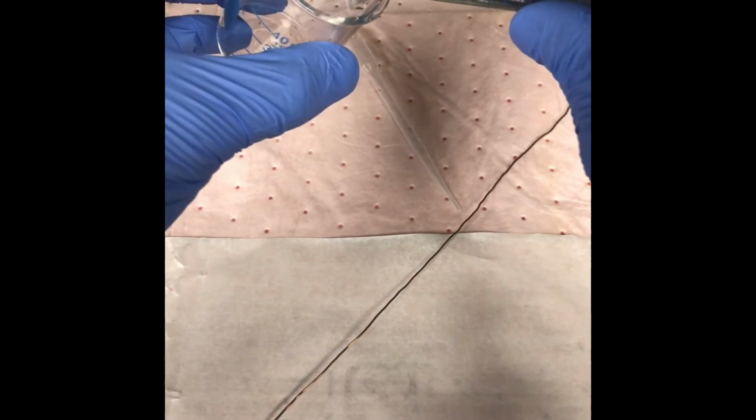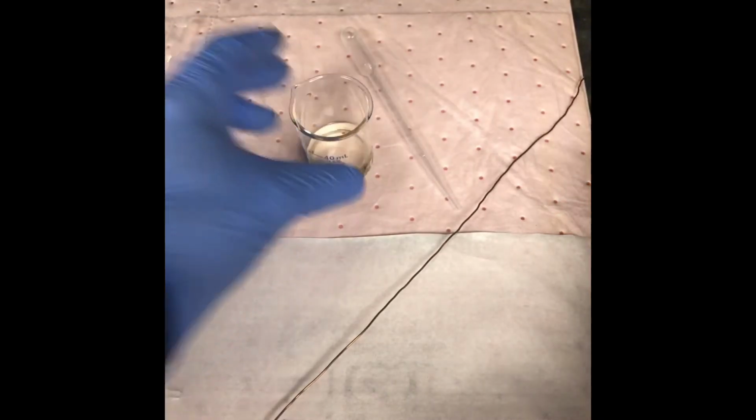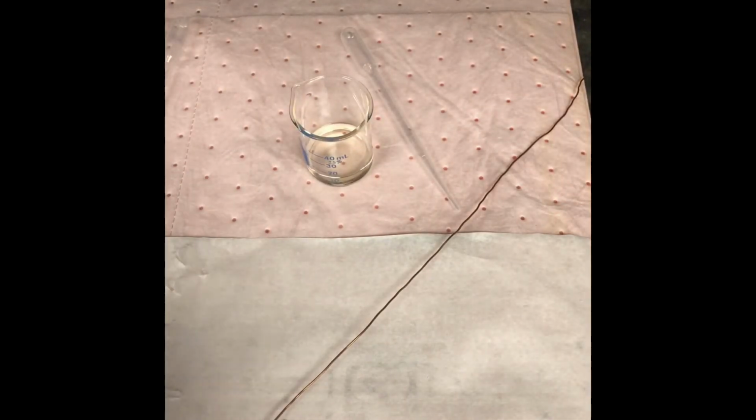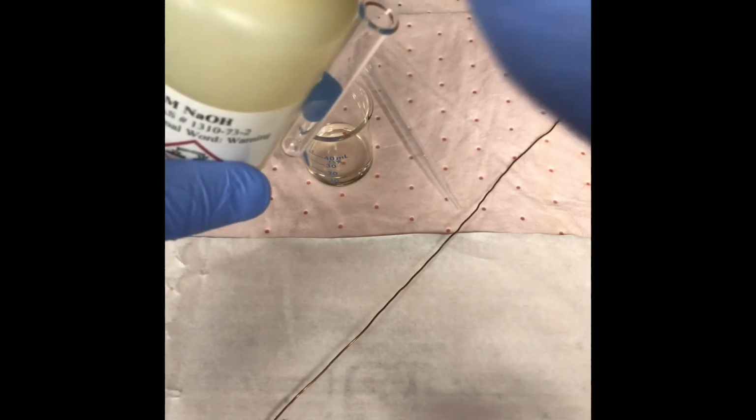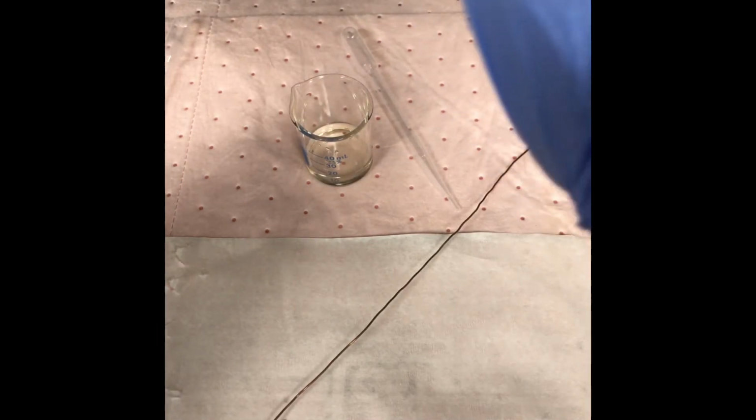First thing is, I will pour in my 10 mils of the hexane diamine into the reaction vessel, the 50 ml beaker. Okay. Next, I will add, I think it says 10 drops of sodium hydroxide, 6 molar, pretty concentrated. 10 drops, half a mil. 1, 2, 3, 4, 5, 6, 7, 8, 9, 10. That's in excess, that's good.